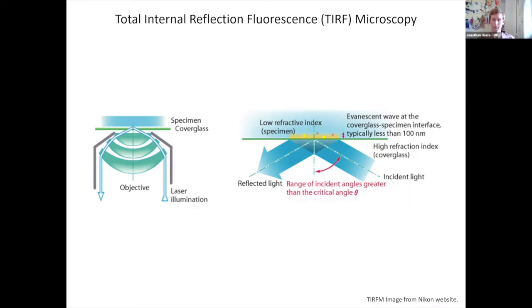So the important thing here, though, is that TIRF only works if your protein of interest is in the TIRF field. So it really needs to be on the bottom surface of the cell, right up against the cell surface membrane, or maybe a membrane protein.